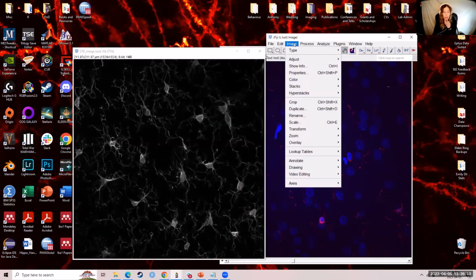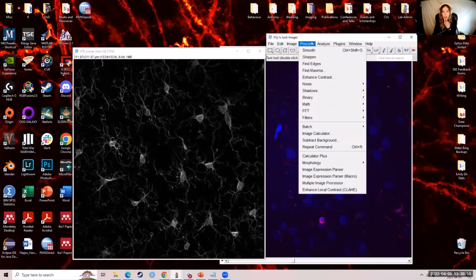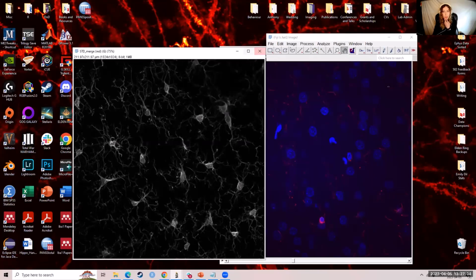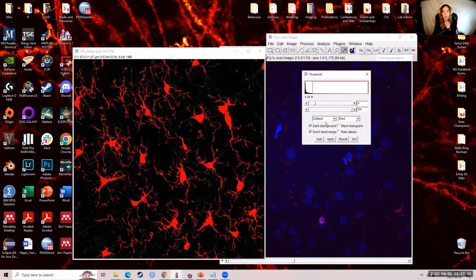In some cases, you can control Z and undo and just try things again. And we will go ahead and go process binary options as it said, and click black background, okay, as it told us to do, and see if that changes anything. So we have our pretty little cells.